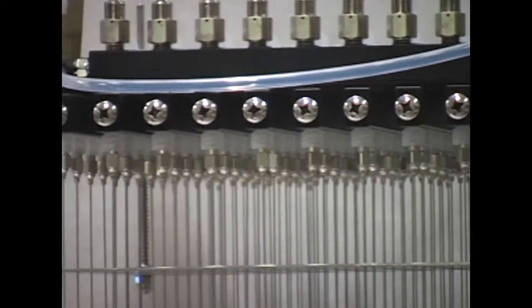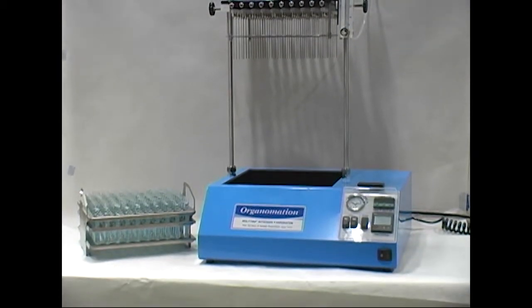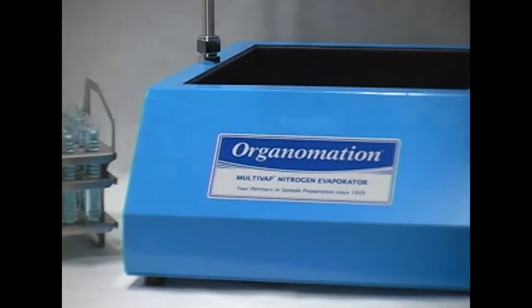Backed by a one-year warranty and complimentary lifetime product support, Organimation's 100-position Multivap continues to be an essential sample preparation instrument in laboratories worldwide.